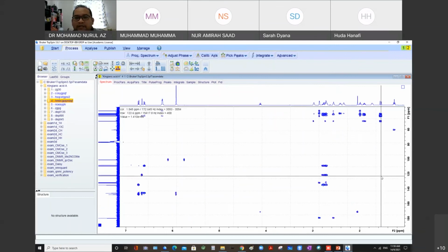So next, you will work thoroughly on NMR. Make sure you understand the basics of NMR. It's very important to understand the basics of NMR before we go to complicated structures. So anybody who is doing natural products, that's why I asked you in the beginning to do literature reviews, so that at least we have an idea what compounds exist in that particular source.